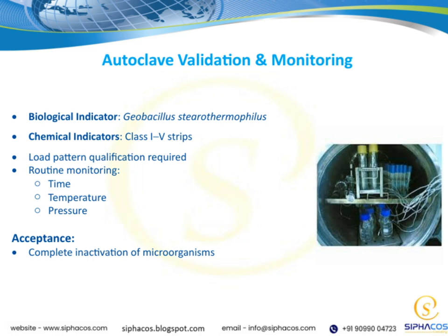Routine monitoring is essential, too. We need to regularly check parameters like time, temperature, and pressure during each cycle. Consistent monitoring helps us maintain the integrity of the sterilization process.